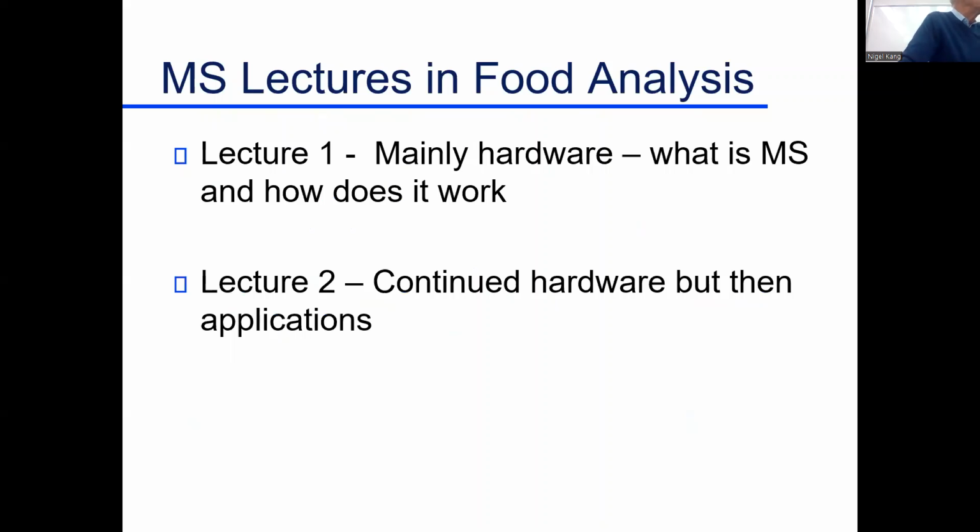Well, we're getting two lectures on this, and lecture number one is today. It's going to be primarily hardware. What is a mass spectrometer? What are different parts of a mass spectrometer? Where do you use these different parts or different combinations? So that'll be primarily for today. And this is a new slide if you happen to have an old one, because I wanted to continue with hardware, but then get into applications more.